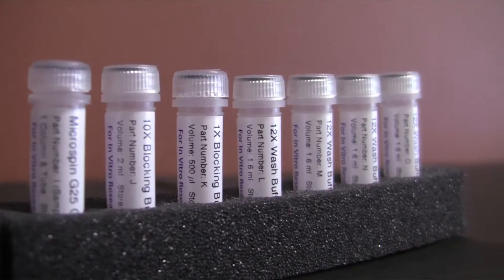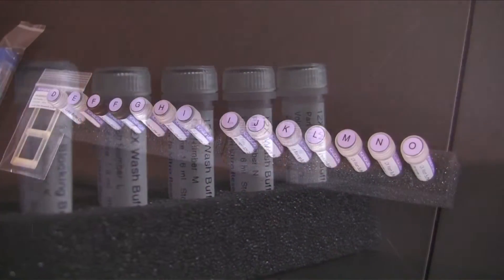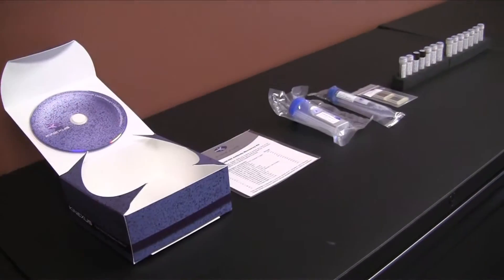Please contact us immediately if you are missing any of these items or if you observe any damage from shipping.